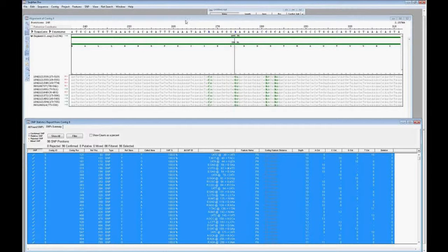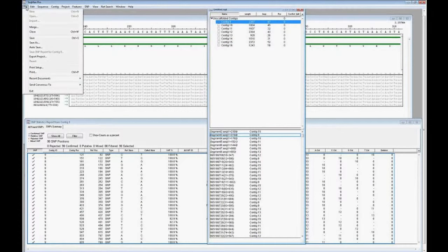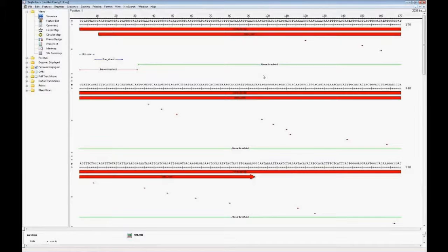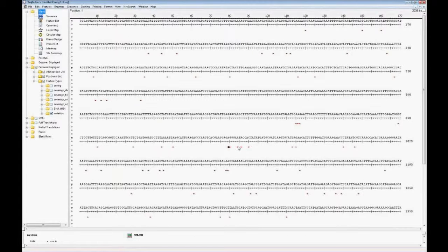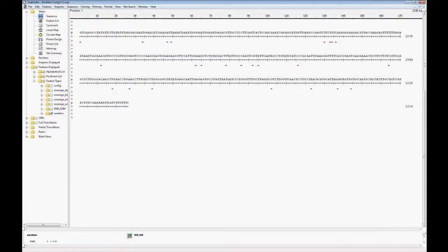Again, you can visualize these annotations in SeqBuilder. So if I look at my Contig and then send the consensus to SeqBuilder, you can build a new reference sequence here. Again, you can look at the coverage thresholds, and you can also see the original annotations from the reference sequence. But I wanted to highlight these variation features, so we'll just turn those on. So here you can see all of the variations along the reference sequence. And those will be saved with this reference sequence, as I mentioned, for any downstream applications you want to use.